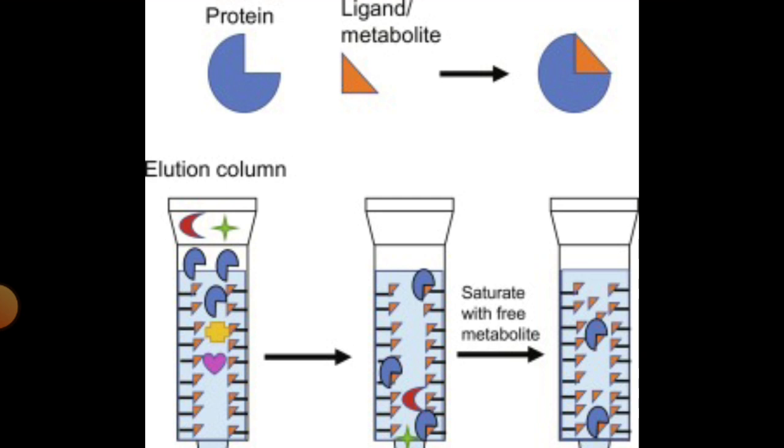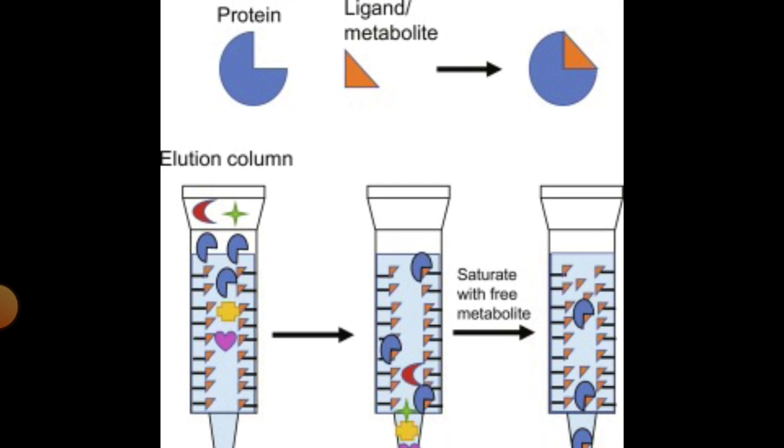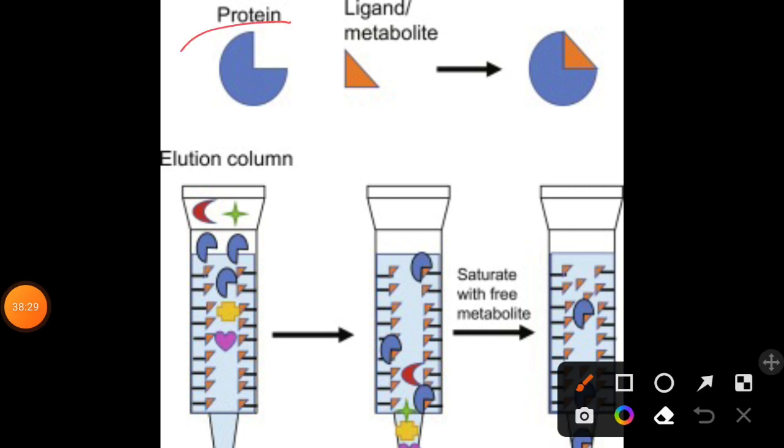Now today's last topic is the affinity ligand chromatographic technique. Here we are utilizing a non-covalent interaction between our protein and the ligand metabolite.